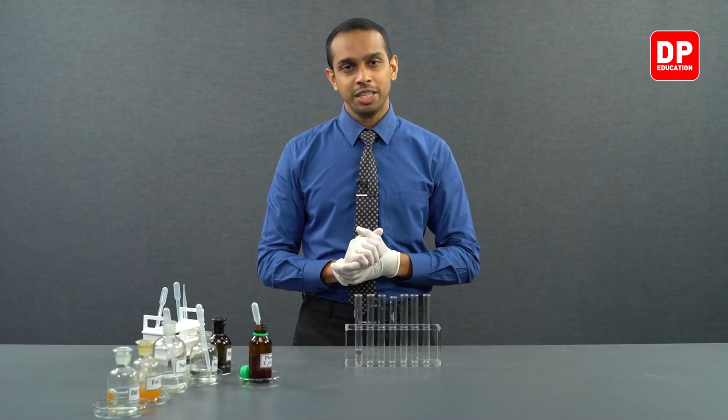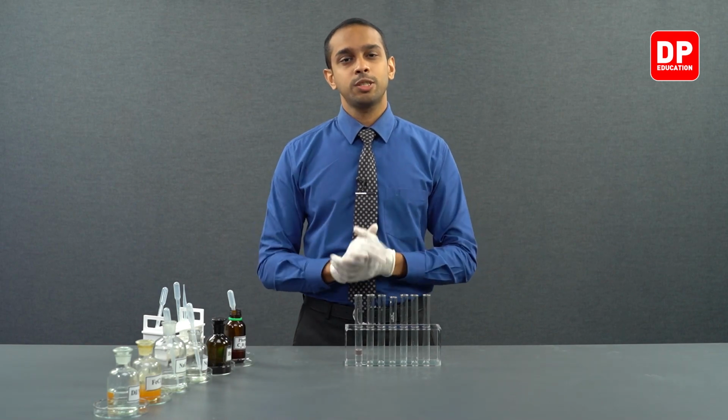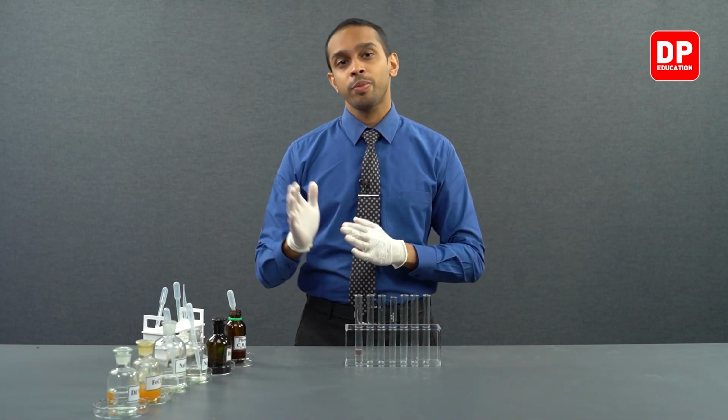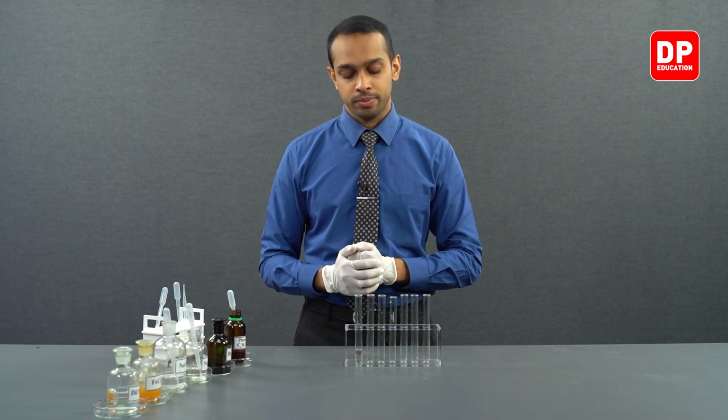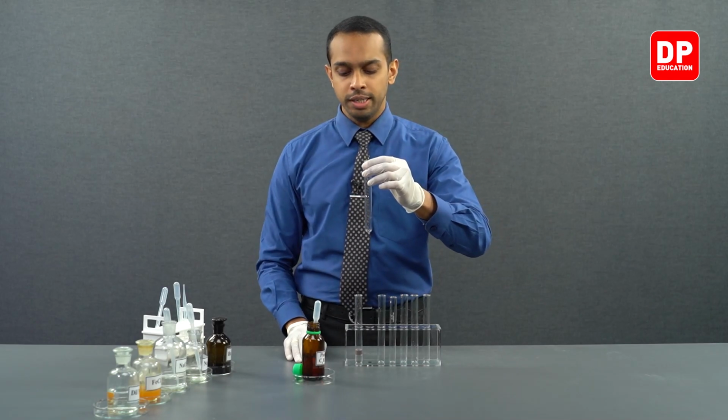Now, let's move on to our next test. In this part of our test, we are going to see the reaction between phenol and sodium hydroxide. First, let's take a small amount of phenol into our test tube. We have our phenol here.